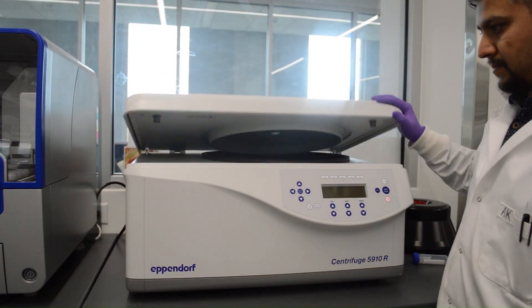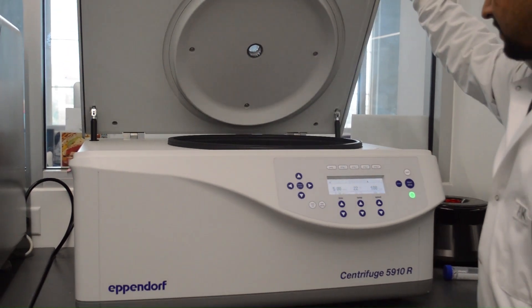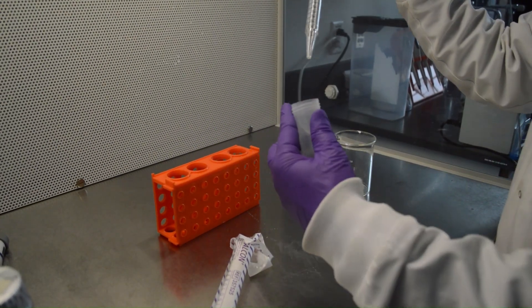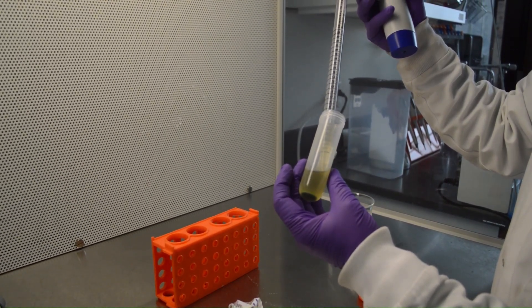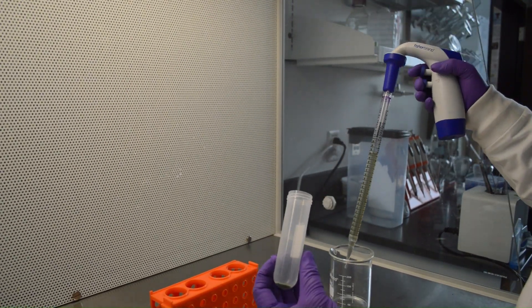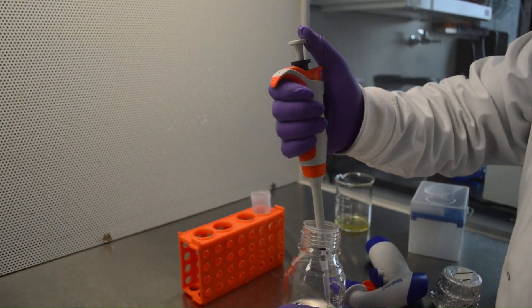Centrifuge the tube at 100 RCF for 5 minutes at room temperature. Discard the supernatant and re-suspend the cells by gentle pipetting with a sterile wide bore tip and 5 milliliters wash buffer.